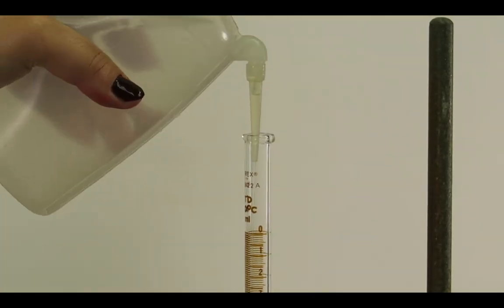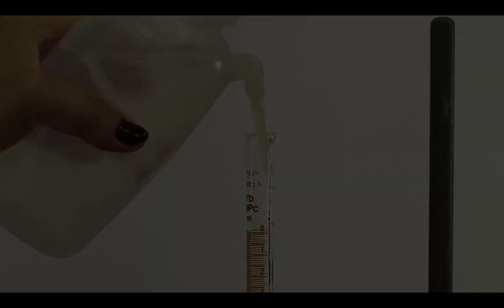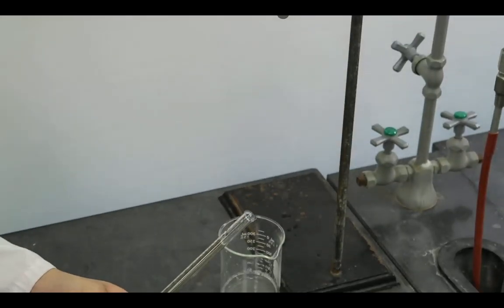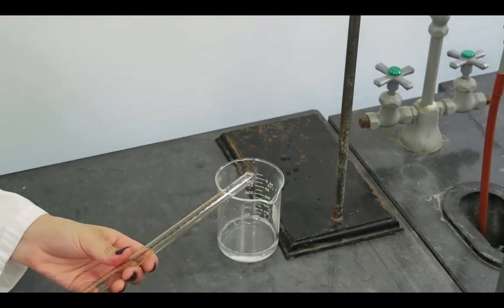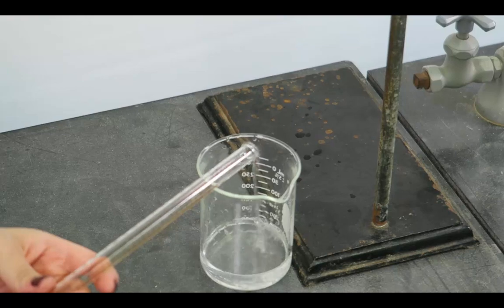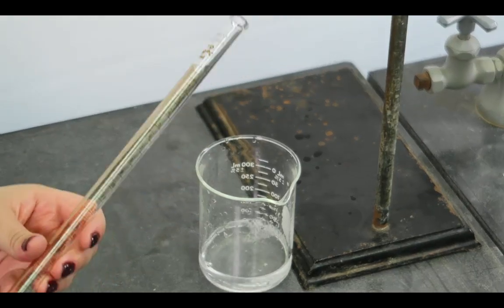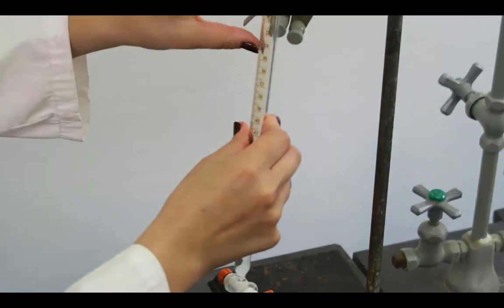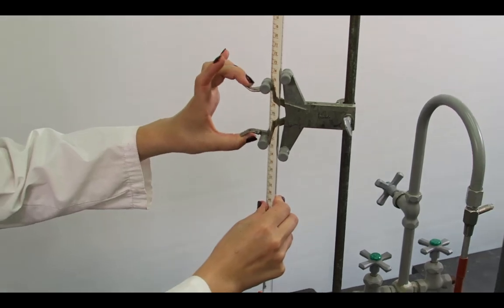Fill the burette partially with deionized water and roll while holding horizontally to rinse. Pour a portion of the rinsings out the top of the burette. Clamp the burette to the stand and allow the remaining water to drain through the stopcock.